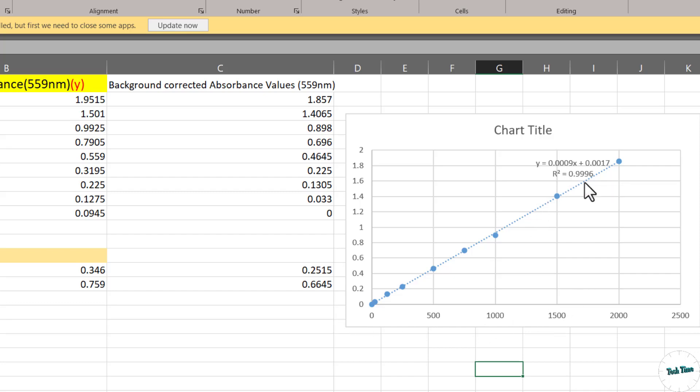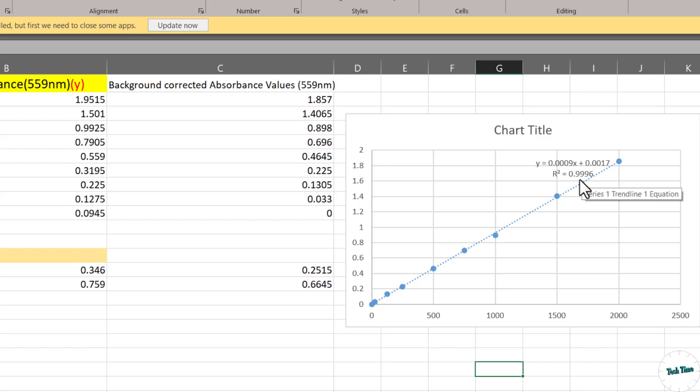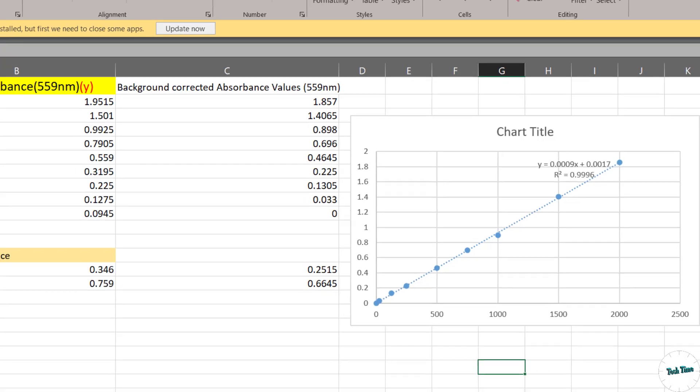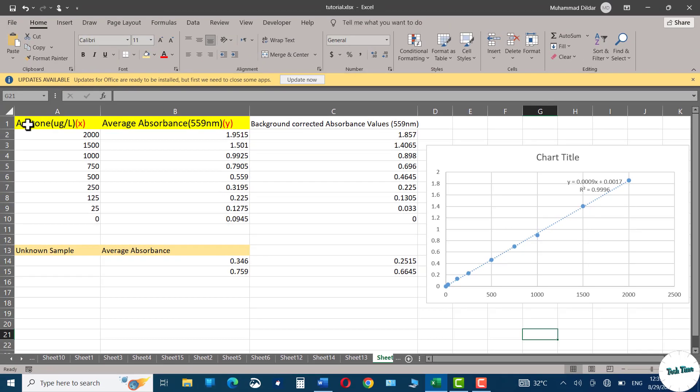R squared value actually shows the correlation between x and y values. If R squared value is close to 1, this means there exists a strong correlation between x and y values. If R squared value is tilted towards 0, this indicates there does not exist a strong correlation. Since in our case R squared value is almost equal to 1, this means there exists a strong correlation between the amount of acetone in water and the average absorbance value.